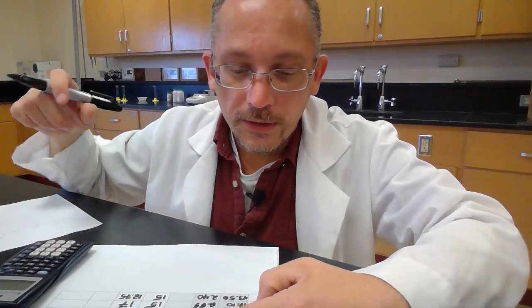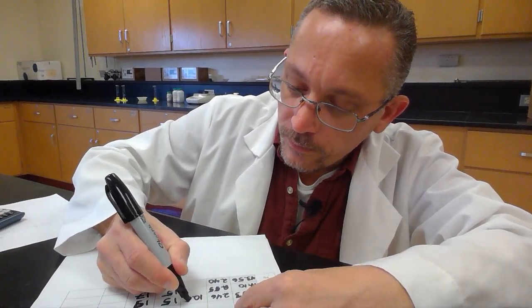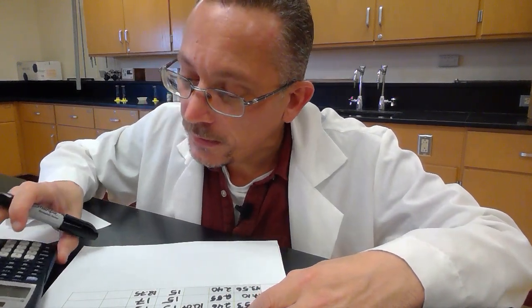And for the first one here, for silicon, 12.53 minus 2.46 gives me 10.07. For tin, I have 17.10 minus 2.55.